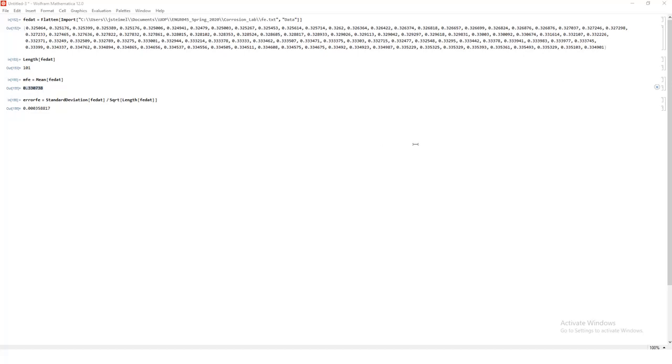That's basically it. Again, read lecture 8. You could look it up in the OER as well. But this is the gist of analyzing this data set.